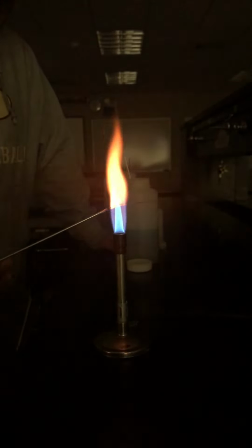That was a light purple. So you have to look close, but that was a light purple. See it? Okay, so light purple for potassium.